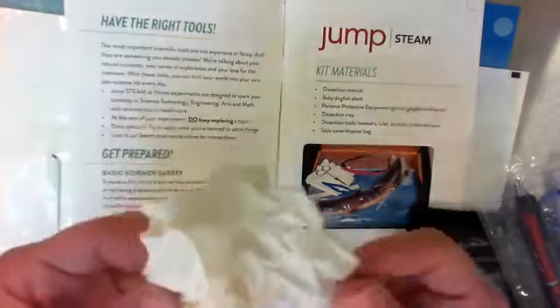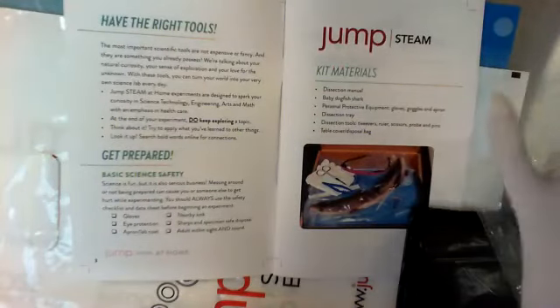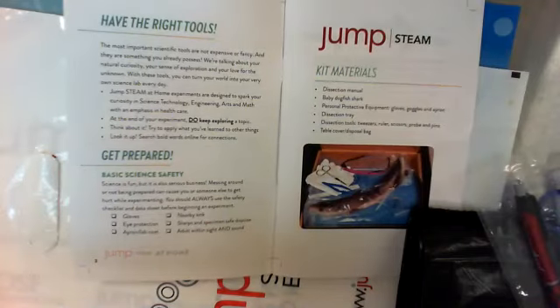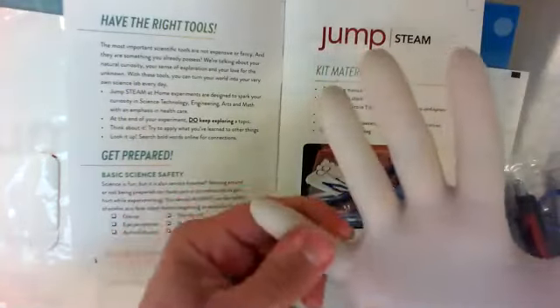You need gloves. You should have received a pair of gloves. I can't remember if they're smalls or mediums. I know they're not larges. I actually don't like using large in my lab, even though I'm a large size, because I like everything to fit tight. So I always wear something that's smaller, and I make sure that the fingers are pulled tight. Of all the hand, the fingers have to be tight.